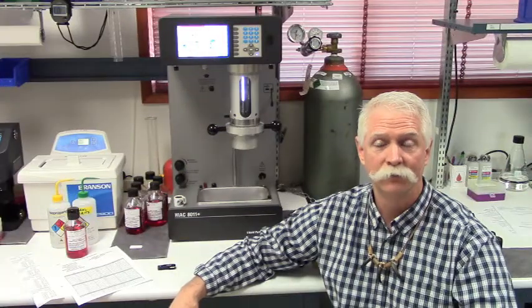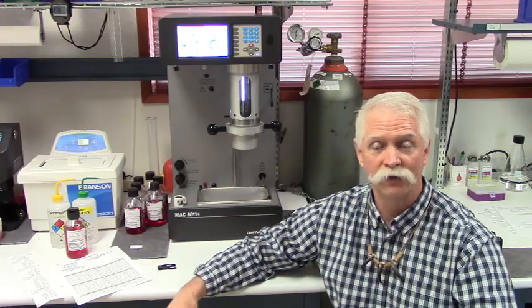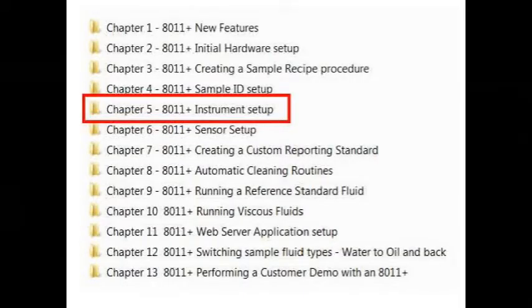The next thing you're going to do is an instrument setup. It's covered in Chapter 5 of the video series. It's a simple little process that allows you to step the customer through the setup of the instrument.